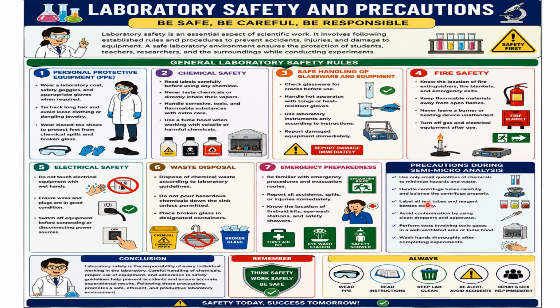That is very important. And for semi-micro analysis, the precaution is that you take a small quantity of chemicals and handle the apparatus and chemicals very carefully. Use a very small quantity of reagent with the droppers and avoid any contamination of these reagents or chemicals. And perform any test which involves the evolution of hazardous gas under a fume hood. Okay, that's all. So these are the laboratory safety rules.